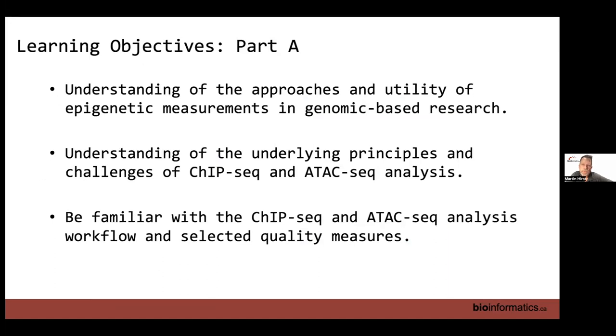So the learning objectives of this first part of this module are really to understand the approaches and utility of epigenetic measurements in genomic-based research. And I'll briefly touch at a high level on why we're interested in studying this area at all. And then we'll talk about the principles and challenges of ChIP-seq and ATAC-seq analysis. And then by the end of this lecture, you should be familiar at a high level with the ChIP-seq and ATAC-seq workflow and selected quality measurements that we use. And then really in the next module, we'll get into some more of the technical details of the workflow itself. So hang on, I've got to close this screen. There we go. All right.